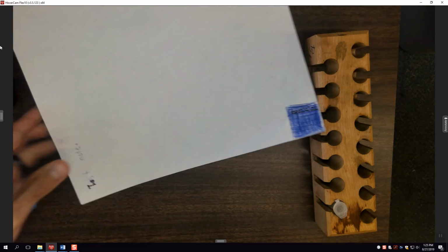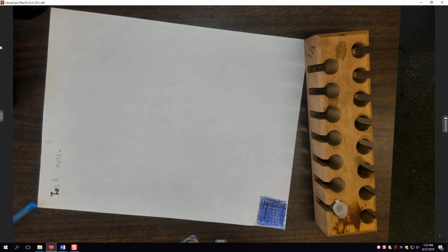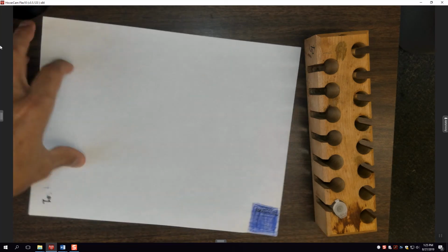Now it says 20 to 30 dots. You may need a little more here, because if you look at the dots, they're actually not going to be completely colored because the hole punch is thicker than the letters, at least in my case. You also might need a pair of scissors. So this will only go, let me show you, this will only go so far into the paper, and I can't get any further.